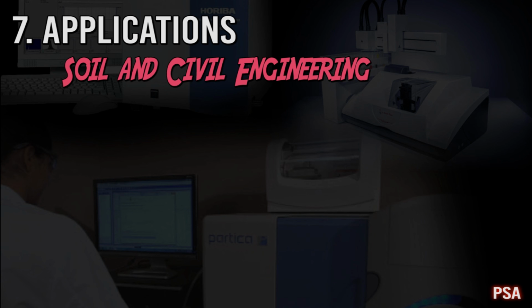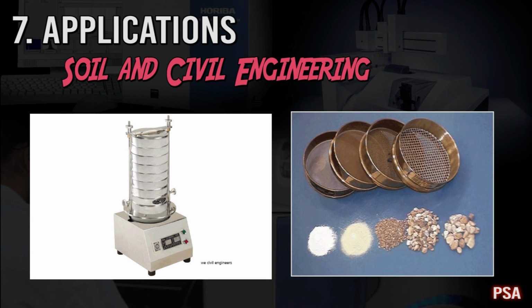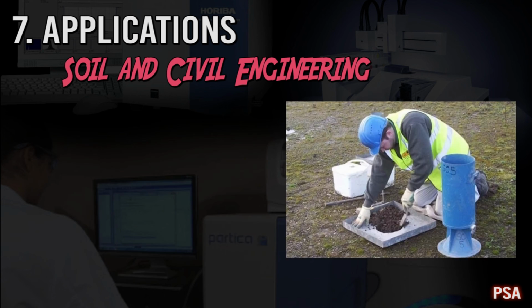For soil engineering, the particle size examination that is measured by the particle size analyzer gives data on the size distribution of the particles. This data is basic in the soil and engineering industries to accomplish various objectives.